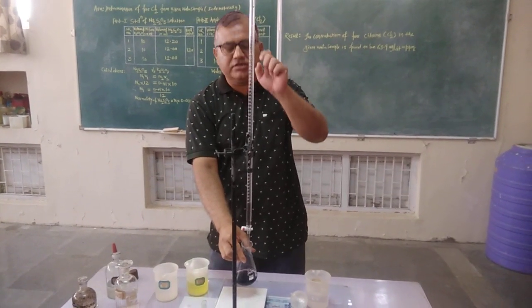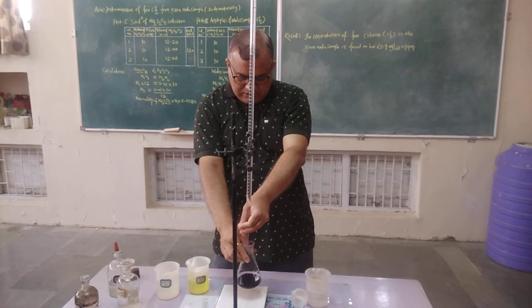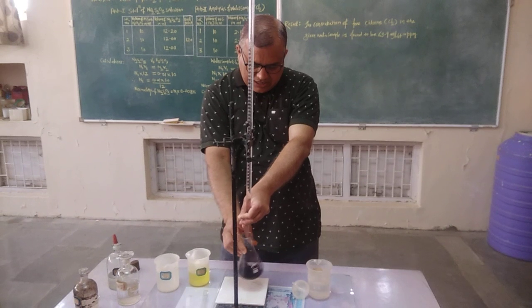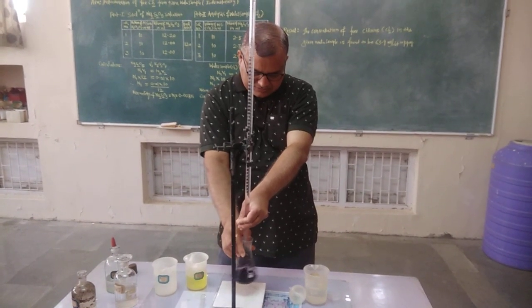So continue the titration from the same point now, and continue it till you get a colorless solution in the conical flask.